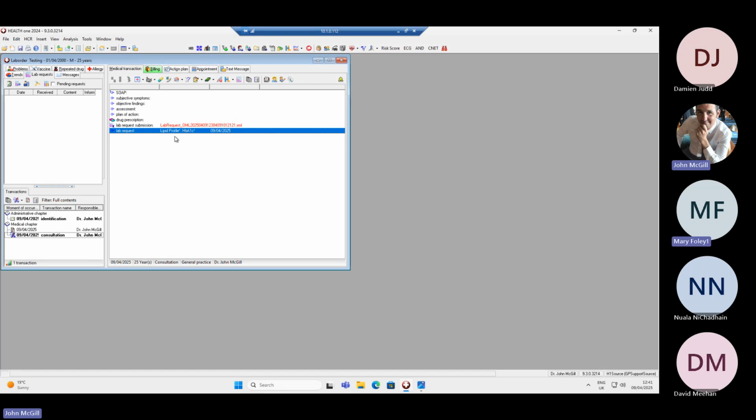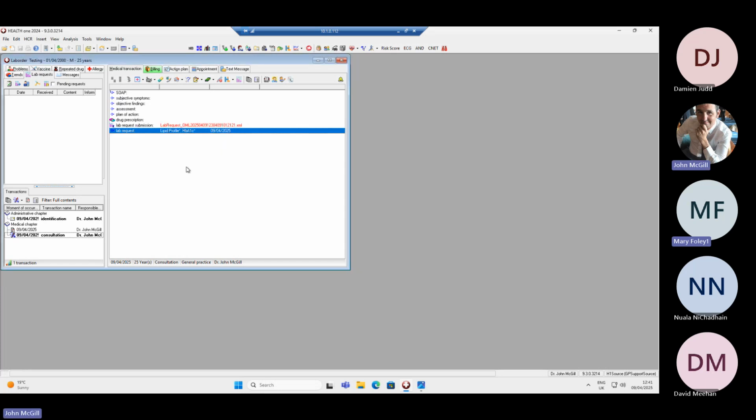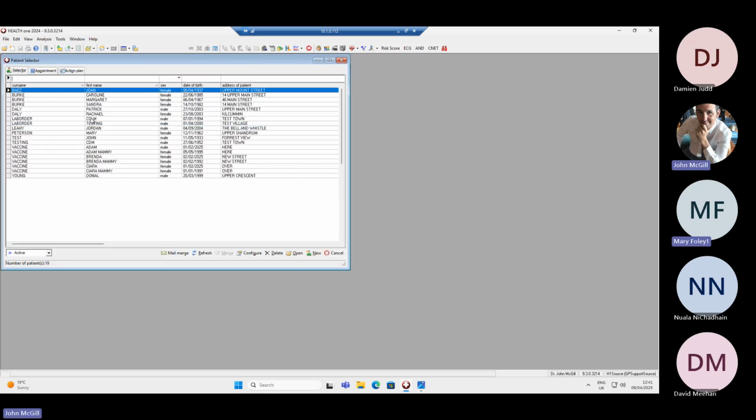So I'm just going to go back in here now to a different patient. I'm just going to show you another thing on the system. I'm just going to save that. And I have another patient set up here.